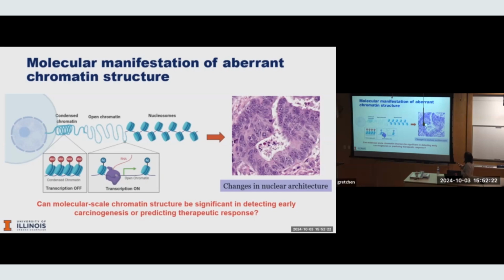That's where the chromatin is. These are the individual nuclei. What you see, the densely packed structure there, is chromatin. At the level of individual nucleosomes, typically you won't see them under the microscope. I'll show you some examples later. At the super resolution level, you can see groups of nucleosomes that are compacted.